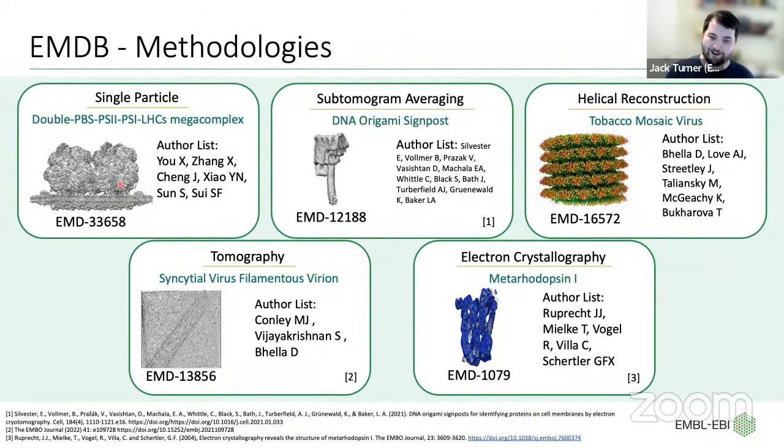It's okay. And if you go to the entry, you'll see the web page is there, although the 200 chains is an interesting task to load. But I thought this was quite interesting. This was only released a couple of months ago, and actually, we often see single particle as this fully developed method, and everyone's doing it, and it's quite standardized now. But people are still pushing the limits of what you can do, at least on the computational side.